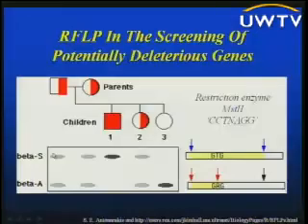So if you take a person's chromosomal DNA and just digest it with MstII, and then probe with the probe that recognizes the sequence in this region, an affected individual should give you a long product, a higher molecular weight product. Whereas a wild type copy of the gene should give you just a short product. So an individual who's completely wild type, with 2 copies of the wild type gene, all you get is a short product. An individual who's a carrier, you get both versions, the short and the long. And an individual that only has the sickle cell anemia gene, as you can see, you only get the long version.